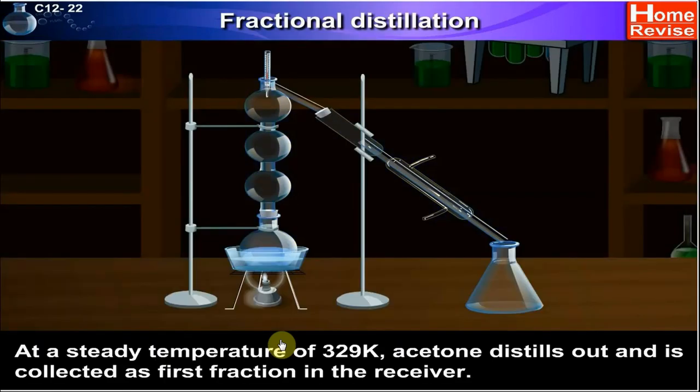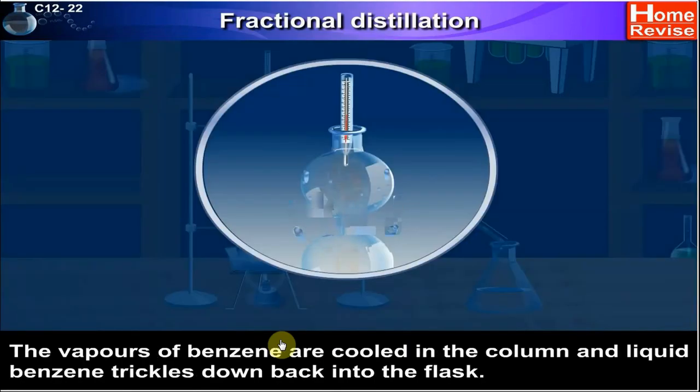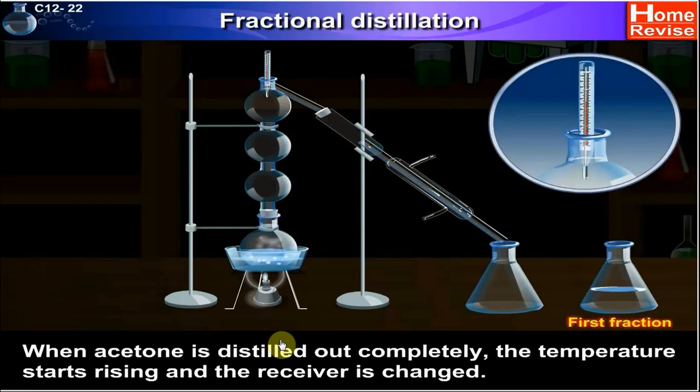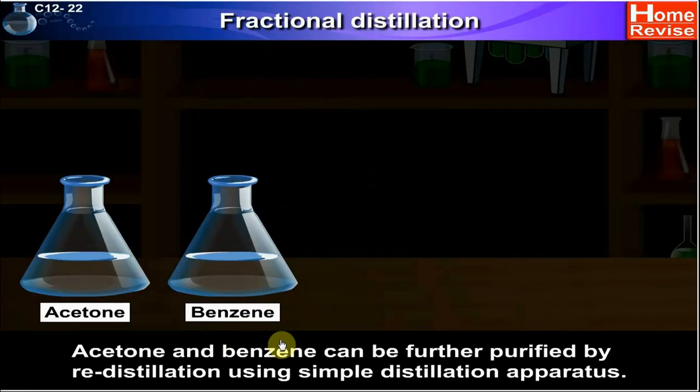At a steady temperature of 329 Kelvin, acetone distills out and is collected as the first fraction in the receiver. The vapors of benzene are cooled in the column, and liquid benzene trickles down back into the flask. When acetone is distilled out completely, the temperature starts rising, and the receiver is changed. When the temperature becomes steady at 353 Kelvin, benzene distills out and is collected as the second fraction in the receiver. Acetone and benzene can be further purified by redistillation using a simple distillation apparatus.